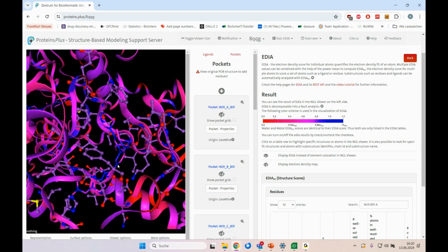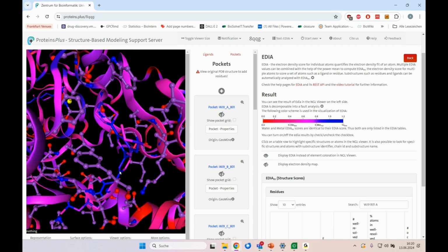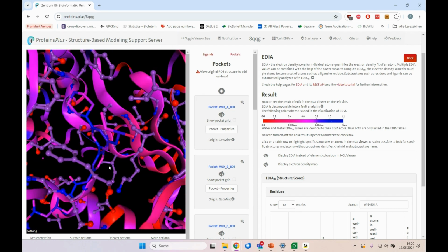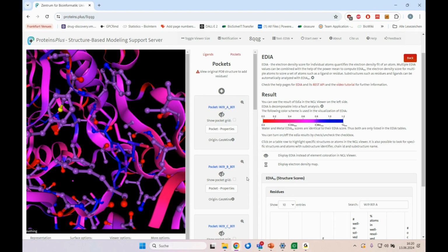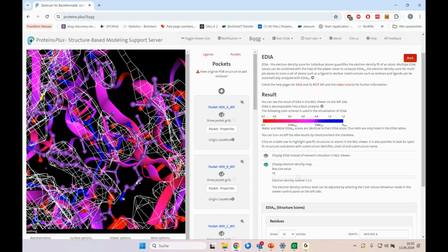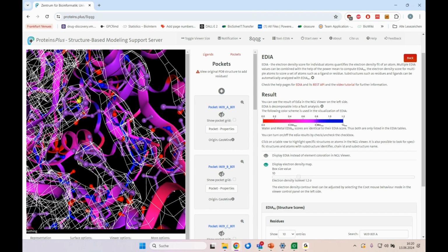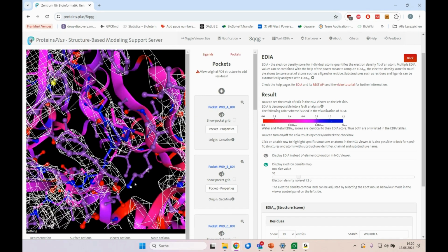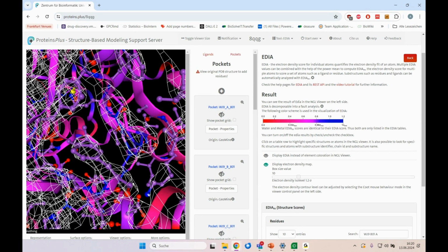Okay, cool. But from my first sight, most of the ligand is blue, so that's fine. You see definitely some flexibility around with respect to the chains also that are recorded. But for now, we should keep in mind there is flexibility with the extensions, but overall, here comes the density, if you wish to actually see this too. And there you already see that the density gets a little thinner in these regions where there is red, right in front of us, where there is red or pinkish color.